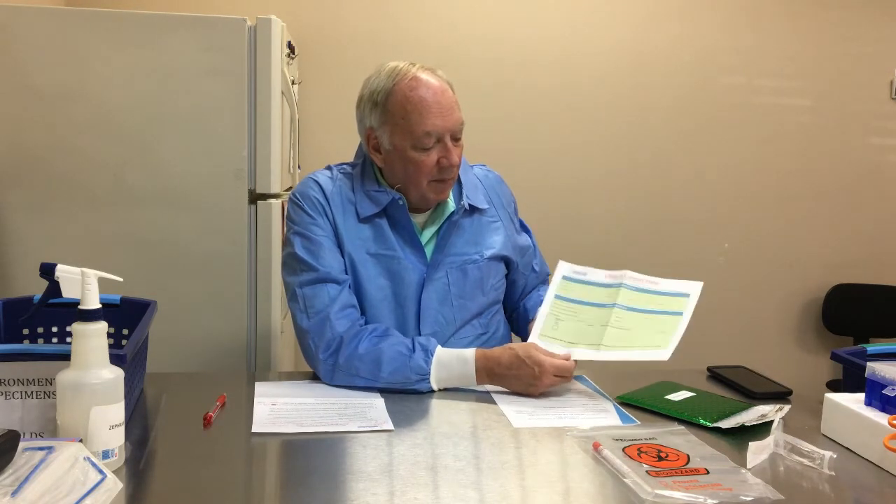You need to mark what testing you want. Do you want the quad mycotoxin panel? A quad panel is a family of four tests covering 15 mycotoxins. You can mark up to three samples on this chain of custody form — if you have three samples, we will assume you want all three tested. The bottom line notes that up to three samples may be combined and run as a composite.